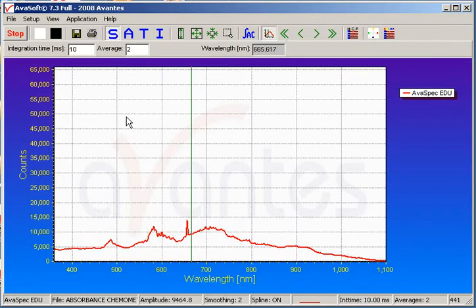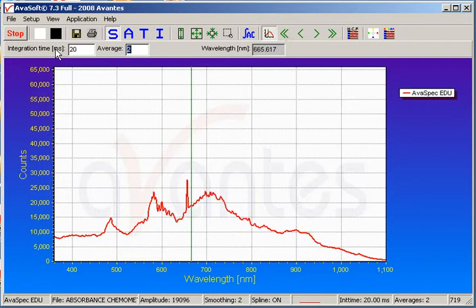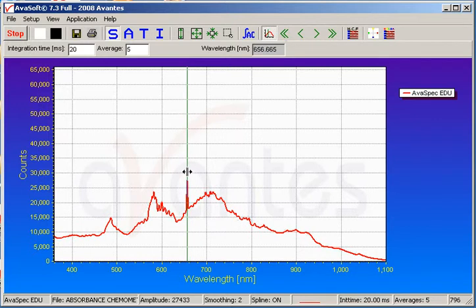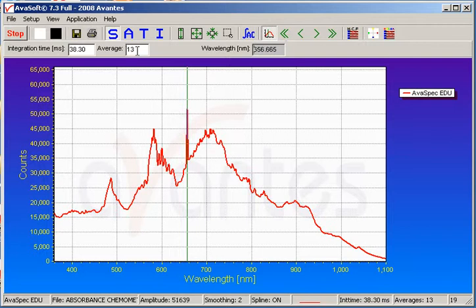Now we are ready to set up the instrument to make it optimal for this measurement. We use Scope mode, which is basically a setup mode where we set integration time and averaging. We can set the integration time manually — for example, increasing it to 20 and averaging to 5 — with the goal of getting the maximum counts at the peak near 656 nanometers to roughly 80% of the maximum, which is 65,000 counts. It is much easier, however, to use the Auto Integration Configure button, which uses an algorithm to find the optimal integration time and sets averaging to optimize signal-to-noise. The square root of the number of averages gives the improvement in signal-to-noise, so it is always important to use averaging.